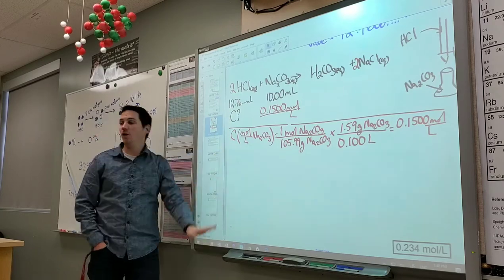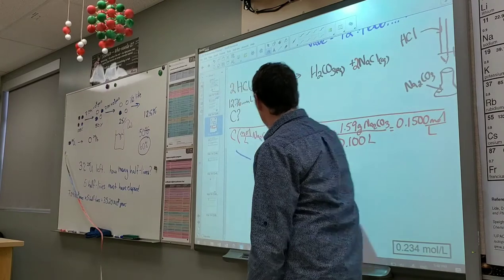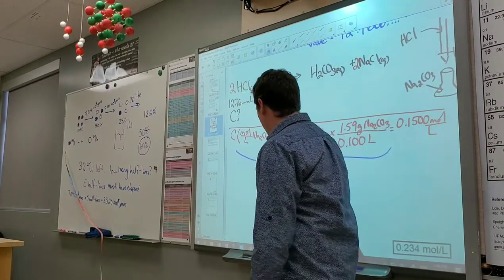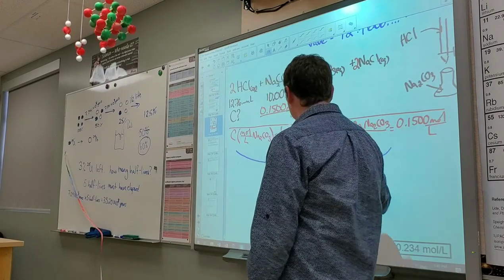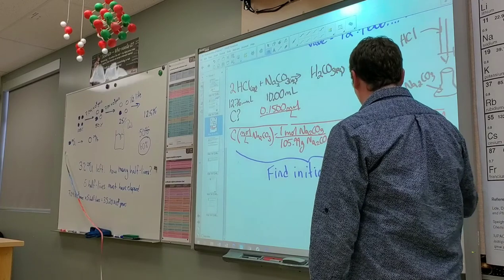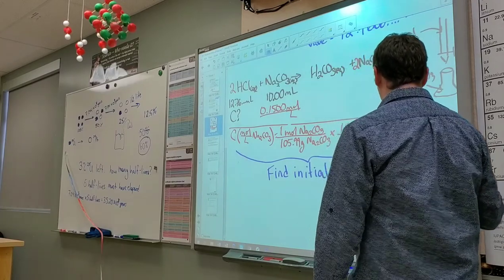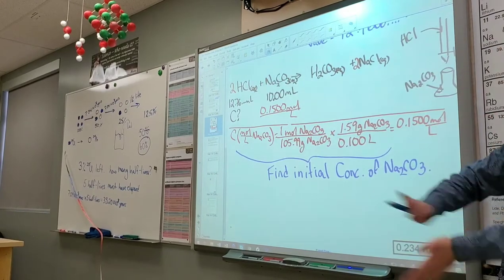So this was the whole purpose. Maybe let's write this down. The whole purpose of this was to find the initial concentration of Na2CO3. That's the whole point of that. We did that. Good. Awesome. Put it aside.